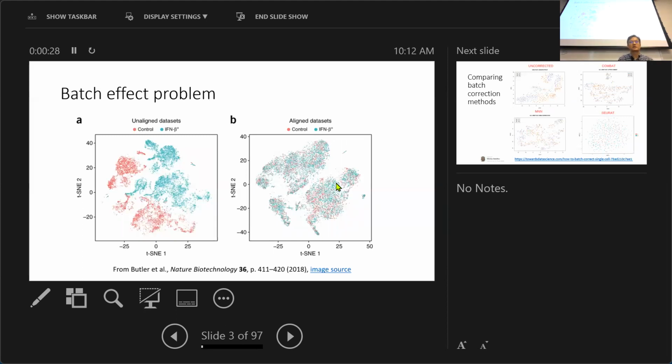So the batch effects problem is not a new problem for single cell data. In traditional bulk RNA sequencing, people realized this could be a problem, so they wanted to use batch effect correction. The example I showed is from a 2018 publication, and they have a control sample, in orange, and these pale colored cells are from this challenge. I don't know what it is, but they believe they're batch effects.